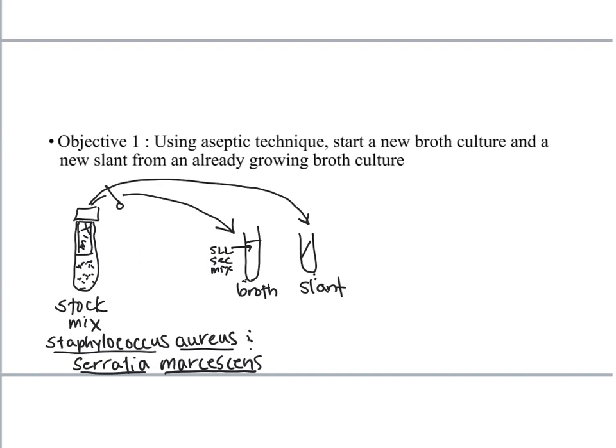That mix is actually two different organisms. It's Staphylococcus aureus and Serratia marcescens. You can see why we allow you to just label that mix because that's kind of a lot to write on a test tube. So remember that's a broth culture that's already growing so that culture is going to look pretty cloudy.